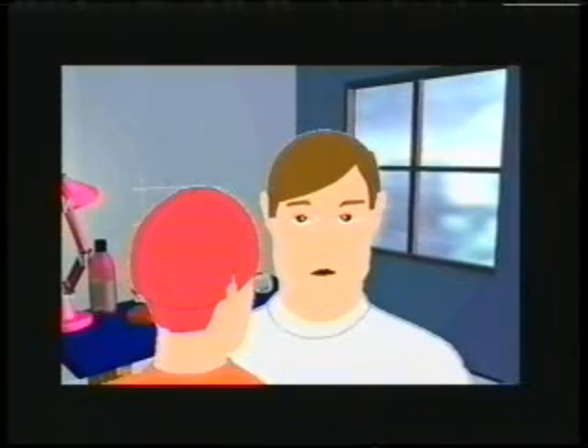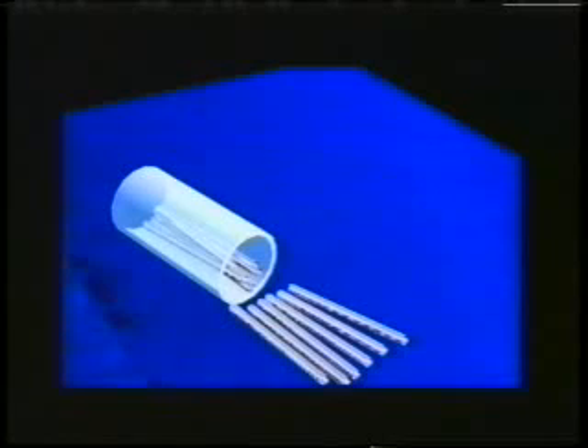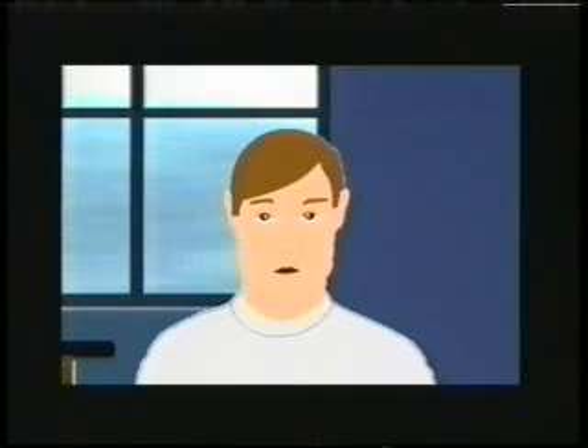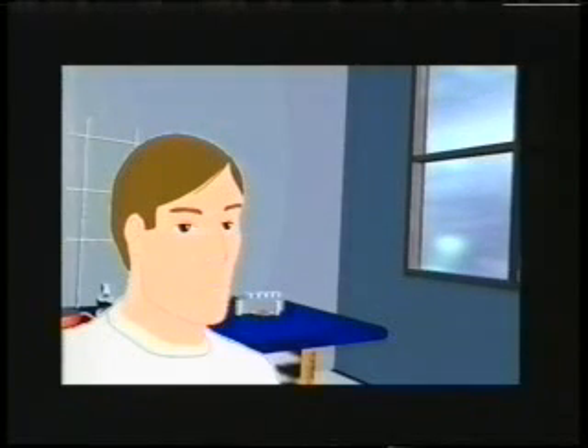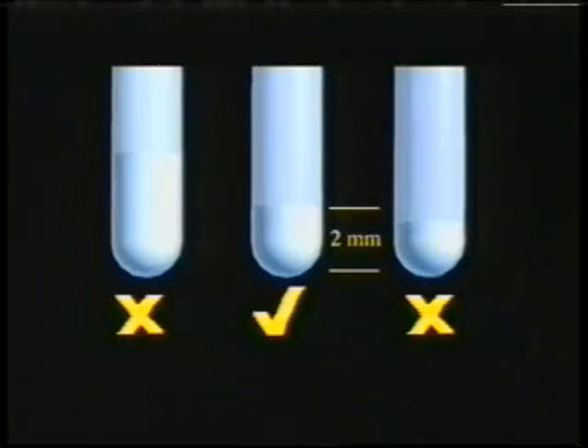Okay, so how about you guys doing some melting points now? What are we supposed to do with these tube thingies? You mean the melting point tubes? What do you think they're used for? To put the sample in. Very good, Phil. Now, packing the sample in the melting point tube is important. The sample should be well-crushed and dry, and only about a 2mm height of sample is required. An improperly packed melting point sample could lead to difficulties in identifying the point when melting begins, and may also result in a larger observed melting point range.